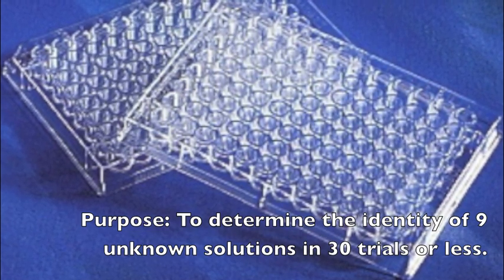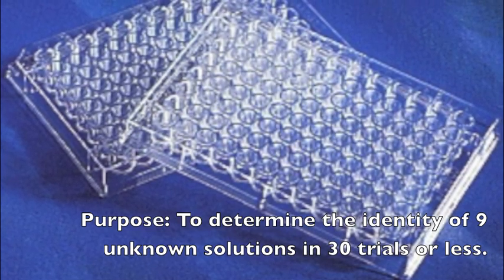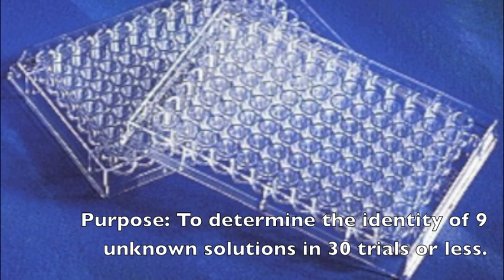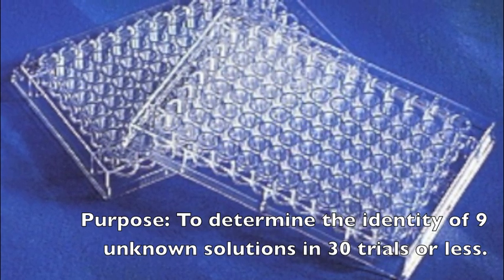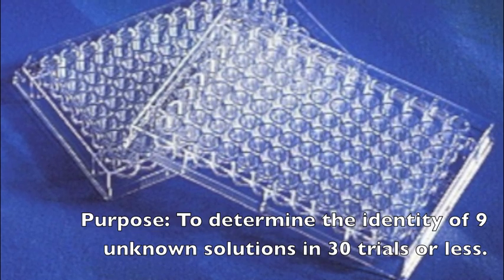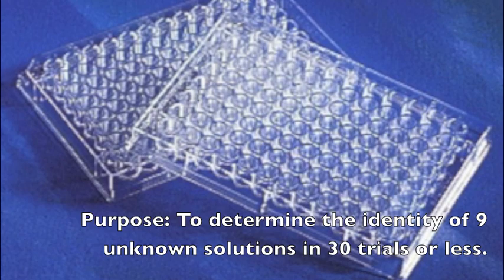Data will be recorded, and the goal of this lab is to do as few combinations as possible. Using observations from the lab and the prepared data table of expected results, each unknown will be matched with its identity. This will be done by comparing frequency and color of precipitates and the production of gas for each solution.